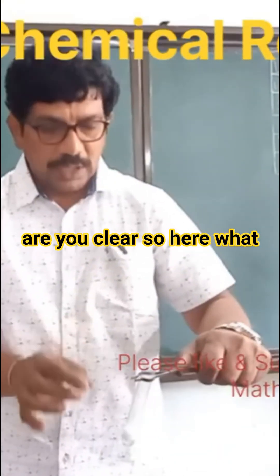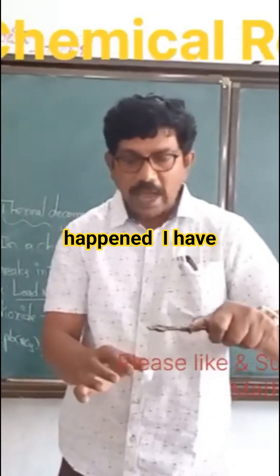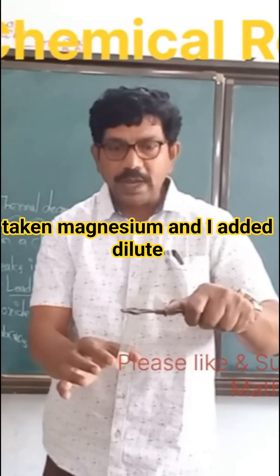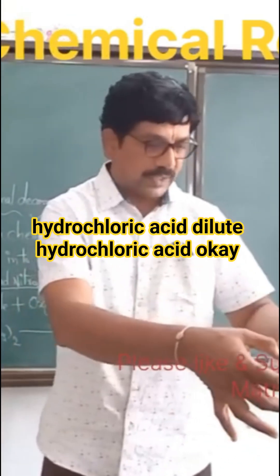Are you clear? So here, what happened? I have taken magnesium and I added dilute hydrochloric acid — dilute hydrochloric acid.